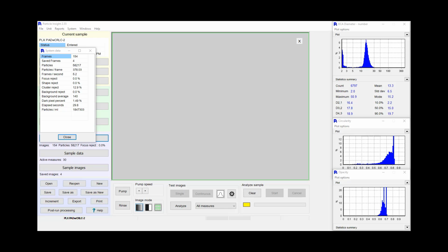So we have a very interesting application today. We have an application where we're doing some characterization of size and shape of stem cells. Stem cells are very unique in that, actually, they're not unique. They're undifferentiated is actually more accurate. Stem cells are a very hot topic these days.